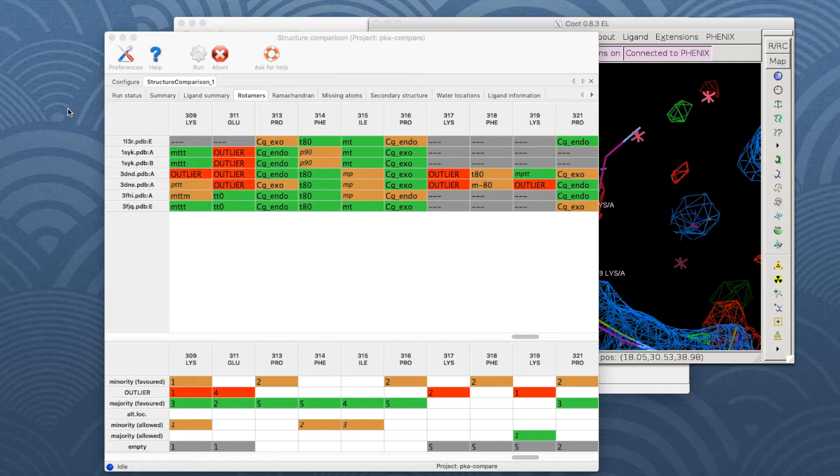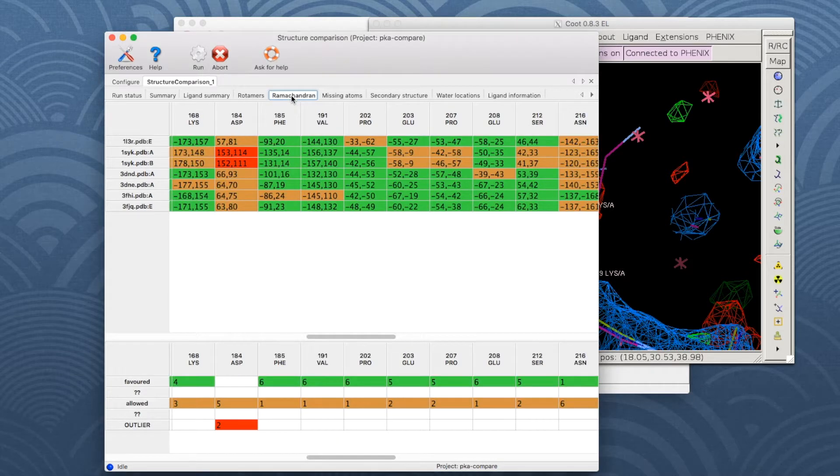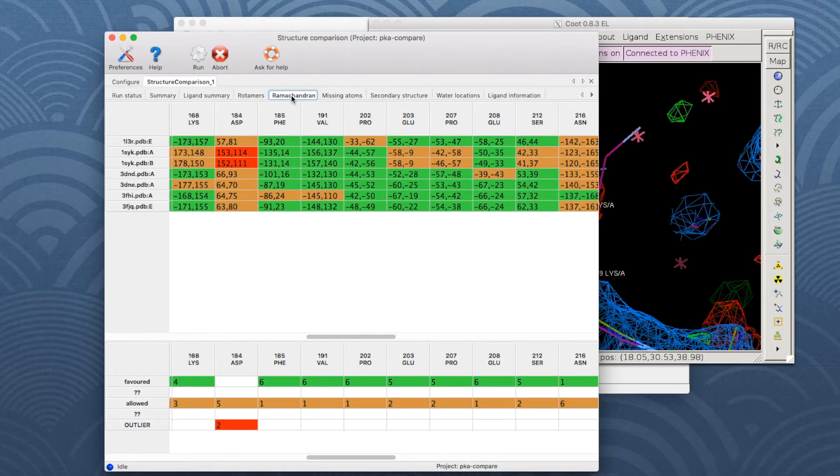The results of the other tabs are represented similarly, so let's go a bit quicker through them. The Ramachandran table shows any set of residues with outliers or multiple Ramachandran angles. The cells contain the values of the angles.